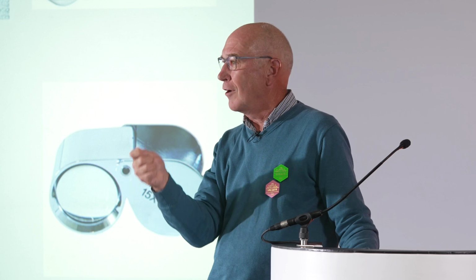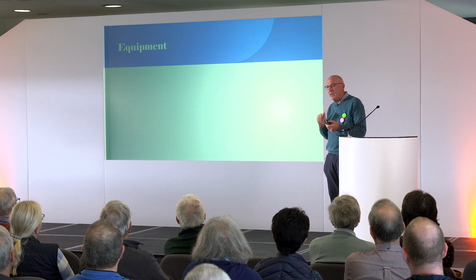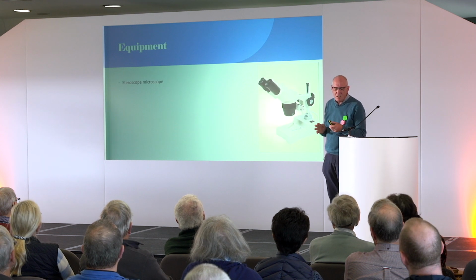Within the first couple of sessions of doing your first couple of slides, people have got their mobile phones out and they've got them going down the eyepieces and taking photographs. We're all so used to trying to take photographs, and people are getting very good pictures from that. But for a beekeeper, we only need really very, very little equipment.